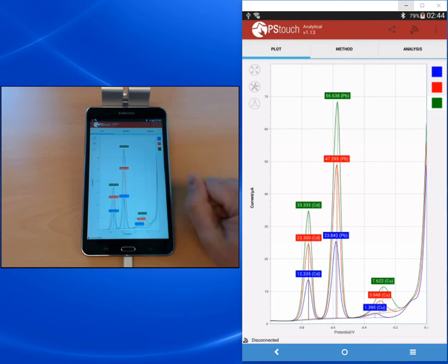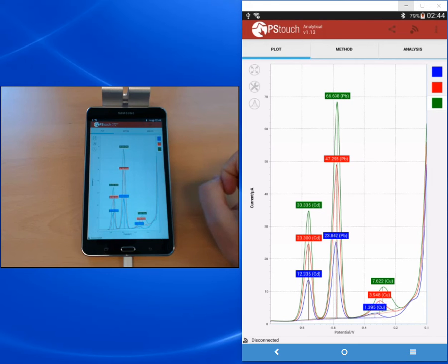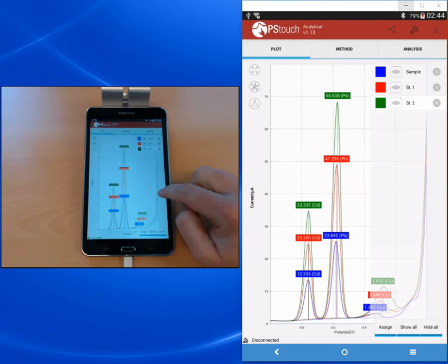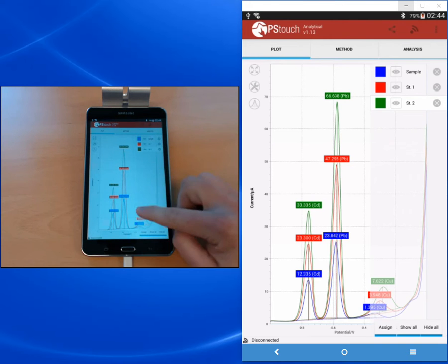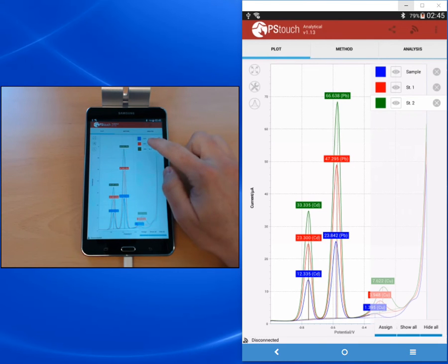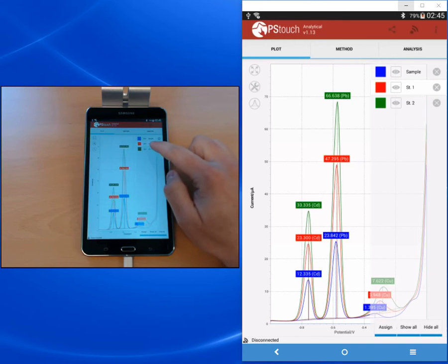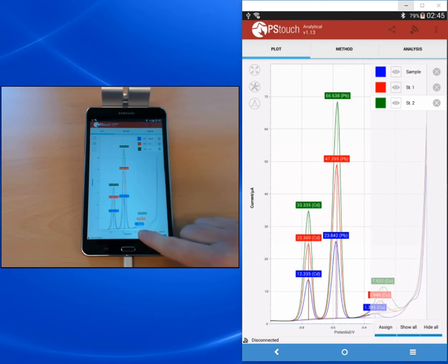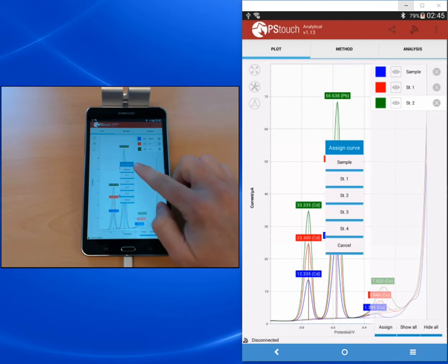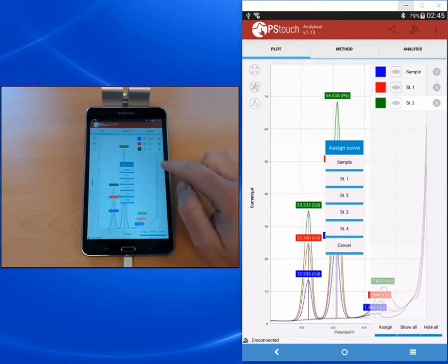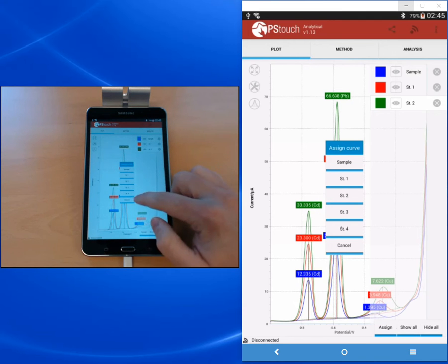First I would like to show you how to assign the curves to certain options. You have to open the curve legend and activate the curve that you want to change the assignment for, then you press assign and you see all your options.